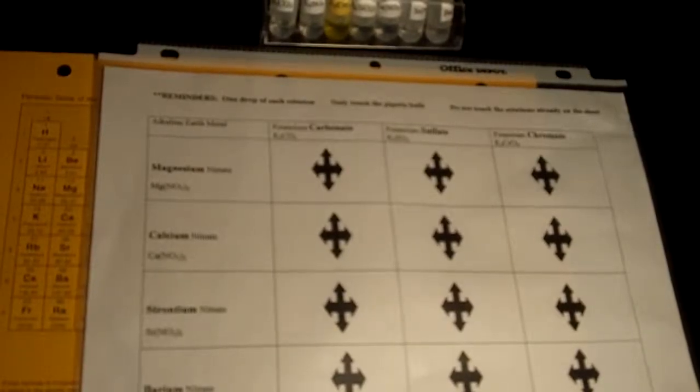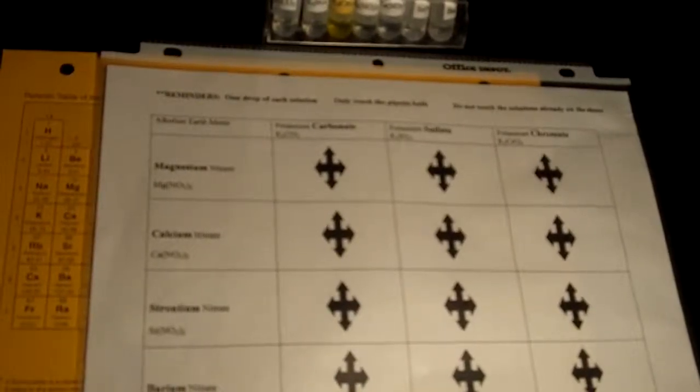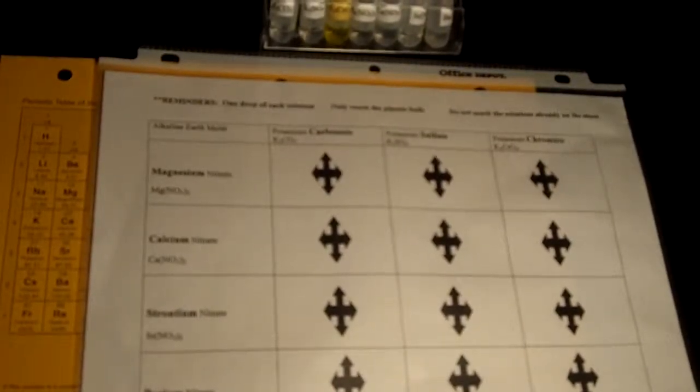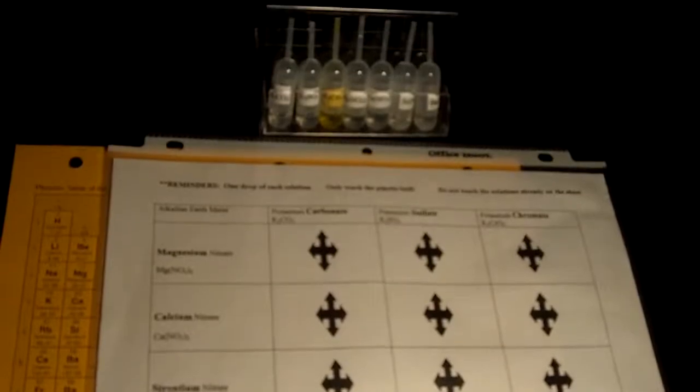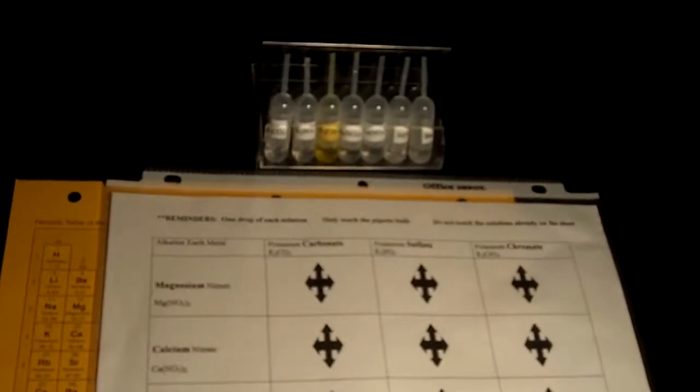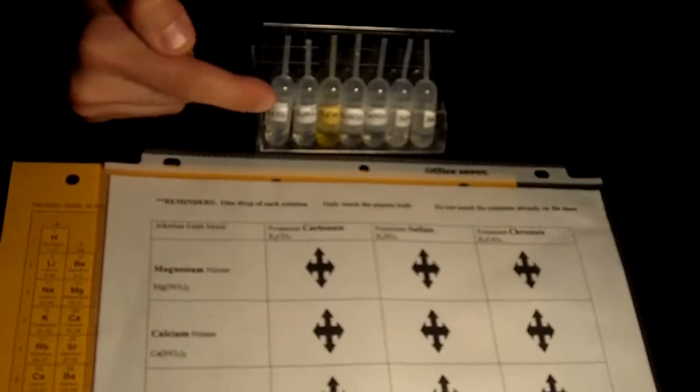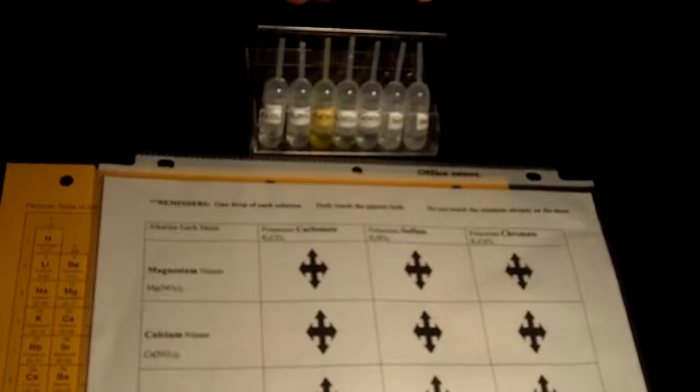The description of the setup. This setup for the lab includes the use of preloaded plastic pipettes with aqueous solutions of 4 alkaline earth metals, as well as 3 potassium compounds you will react with them. We have them here, the potassium compounds and the alkaline earth metal element compounds.